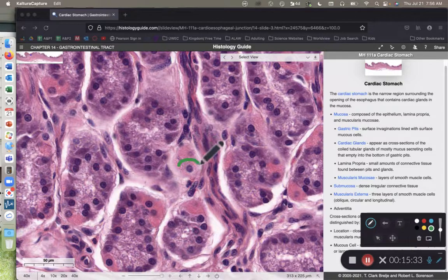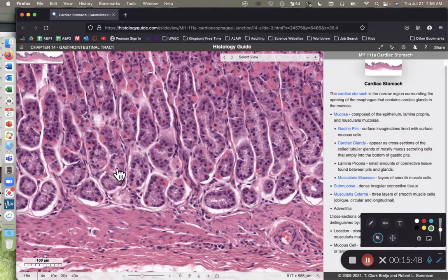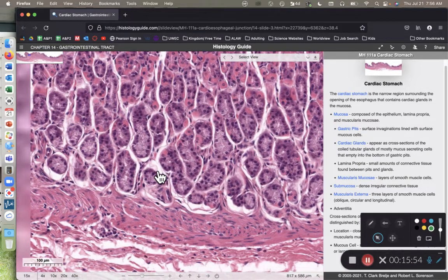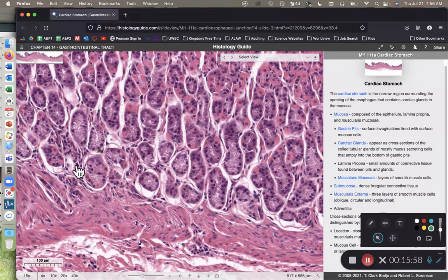So note the clear band. We have a purple nucleus right here, and there's a faint clear band around that purple nucleus. That's an enteroendocrine cell. I'm not terribly pleased with that one, though. That's a lower quality enteroendocrine cell, at least in my opinion. So let's see if I can find you a better looking one. I'll spend just a few more moments scanning this view.